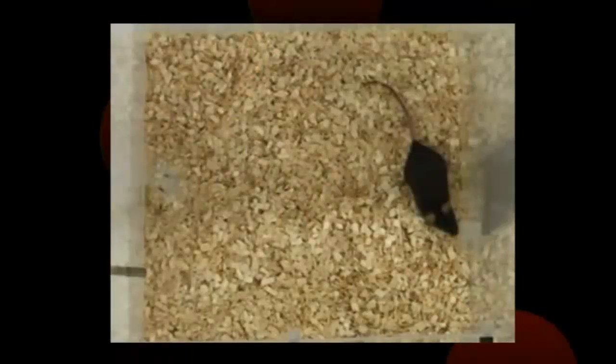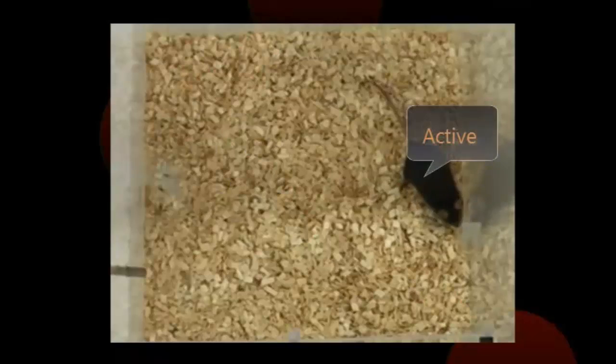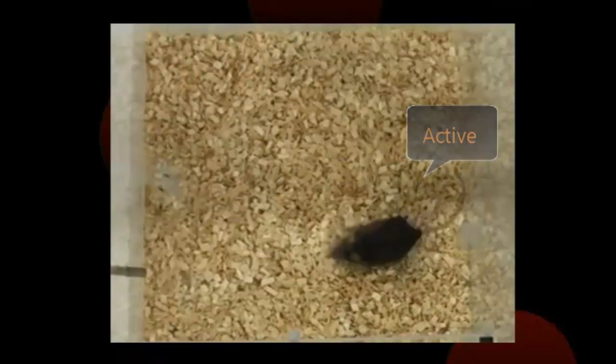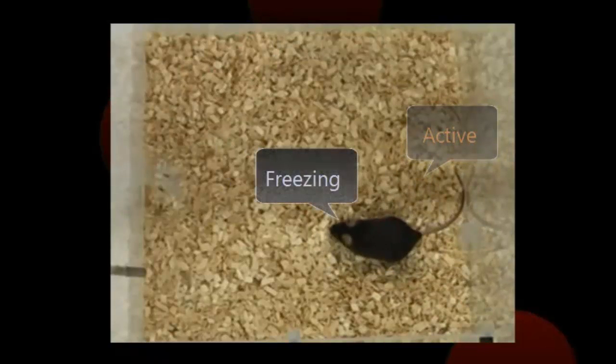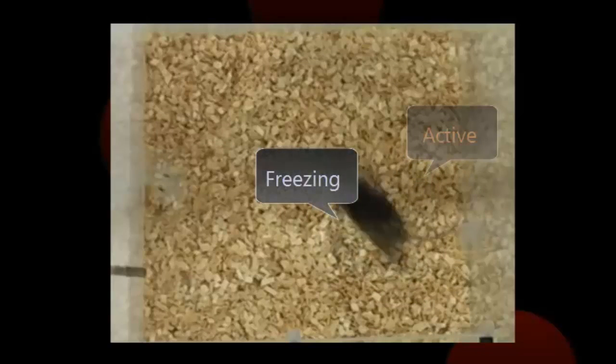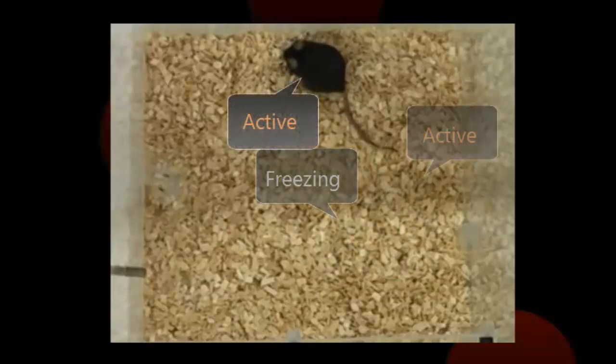With activity analysis you can quantify the level of activity of the animal. You can use this function when the mobility variable doesn't give the expected results. The reason is that mobility is based on the change in the subject surface area. When proper detection of the subject area is problematic, mobility may give unreliable results.